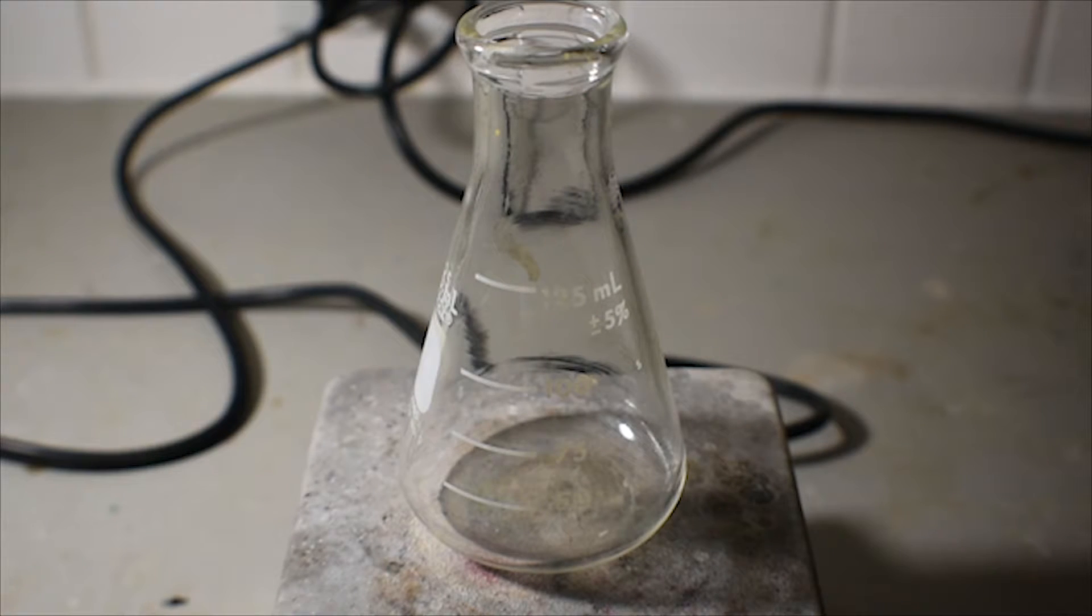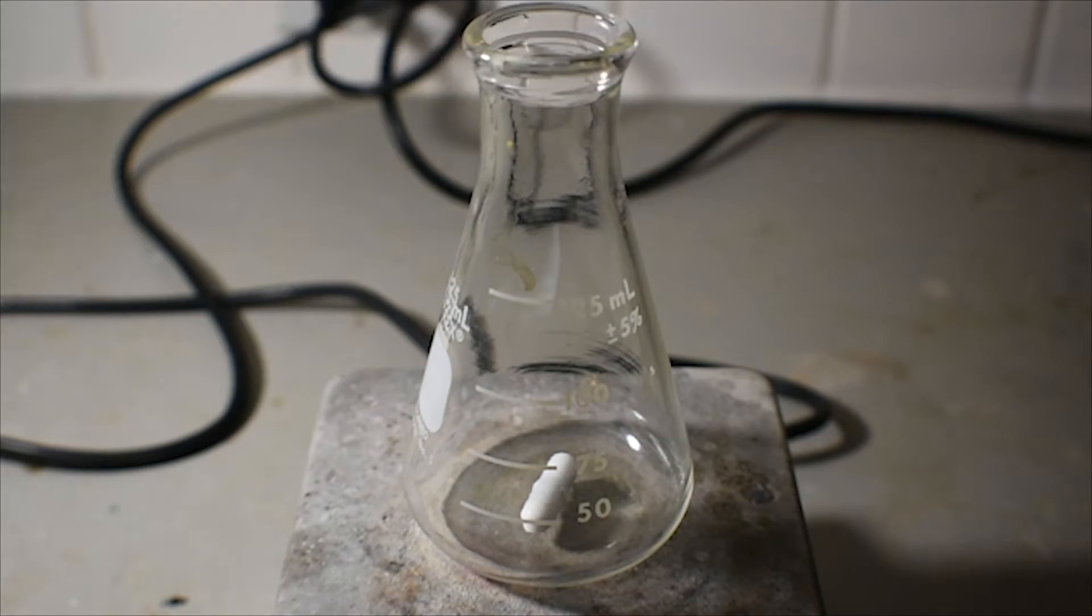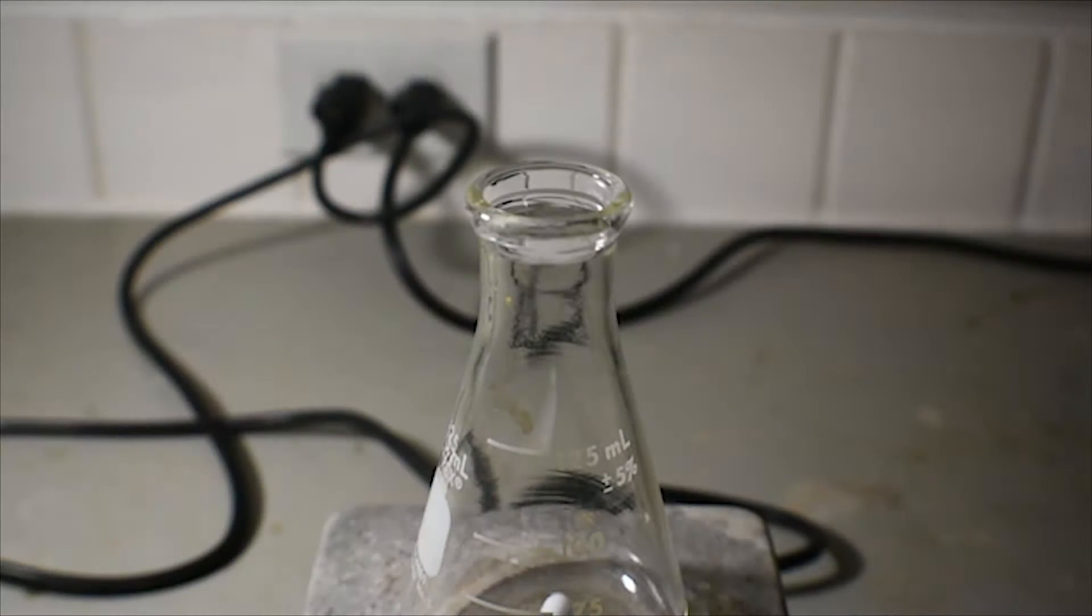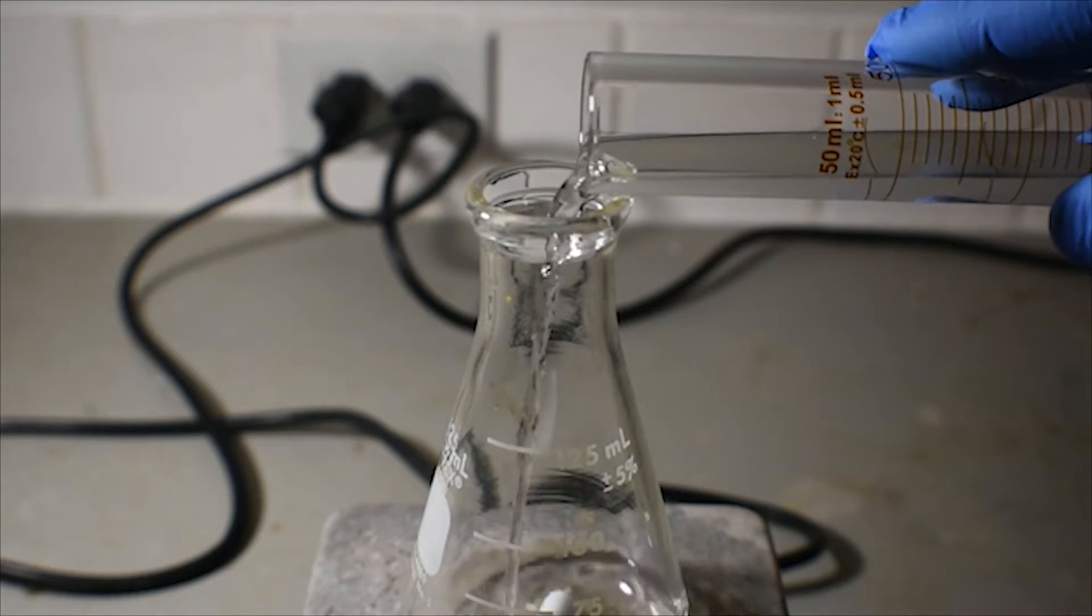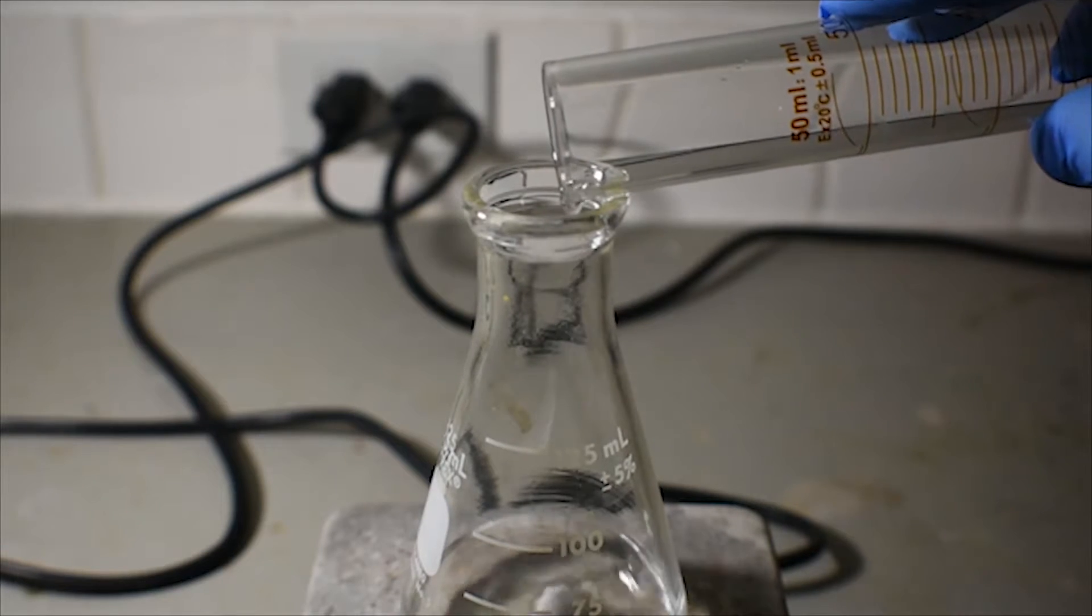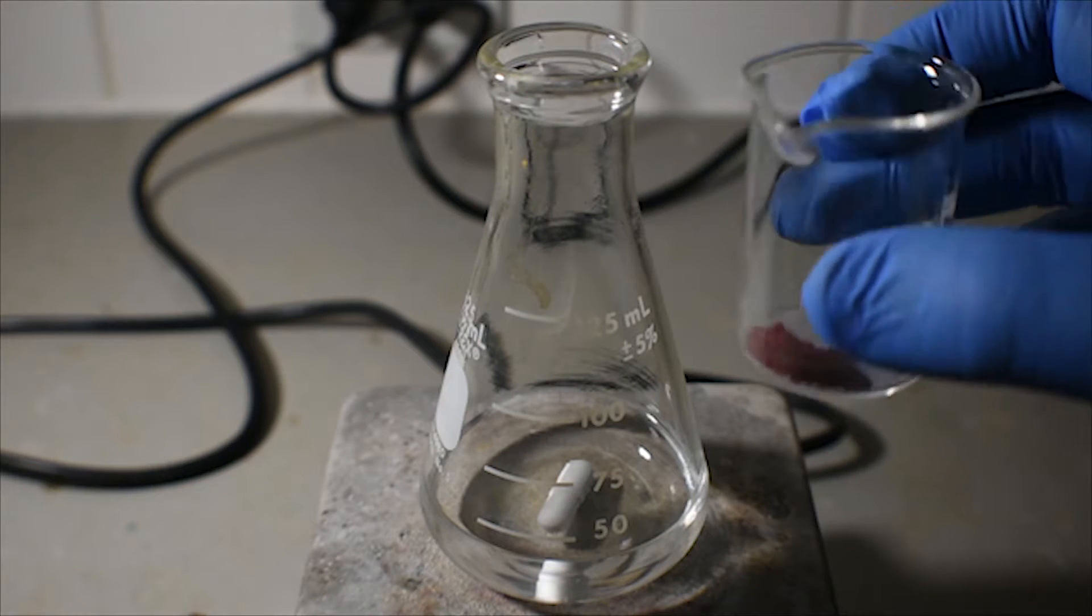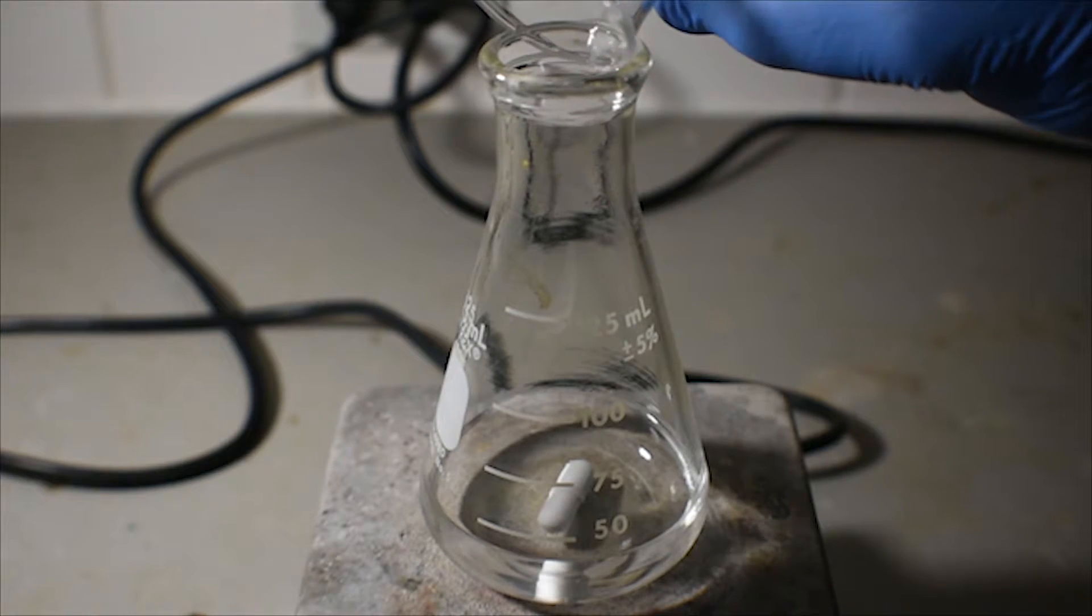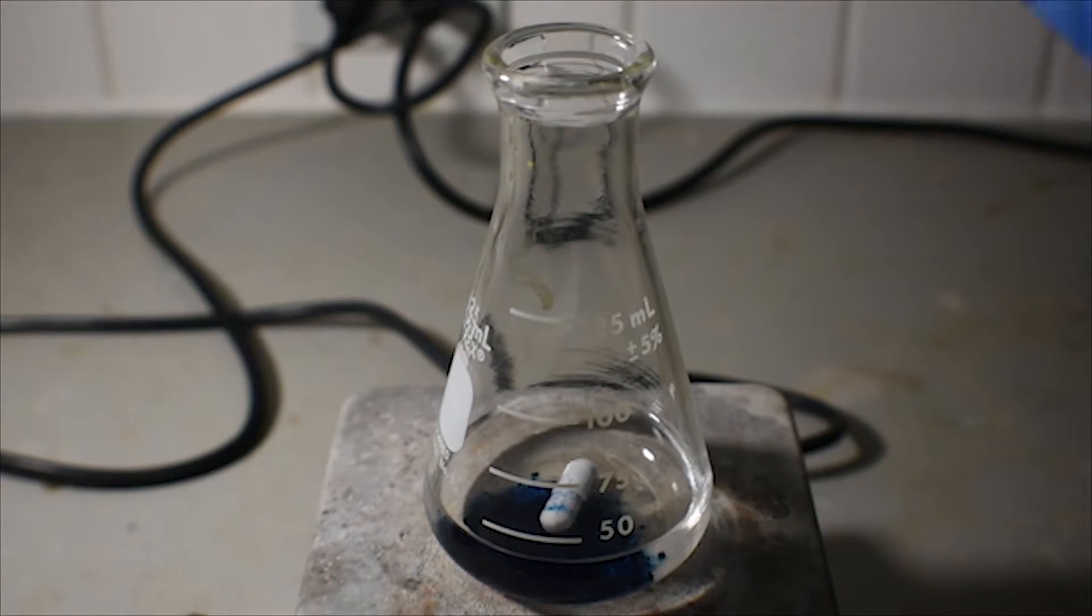Here, on the hot plate stirrer, I have a 125 milliliter Erlenmeyer flask. To this, I'm going to add a medium-sized stir bar. Now I'm going to add the 30 milliliters of 95% ethanol. It doesn't particularly matter in what order you add the reagents, so I'm going to add the cobalt-2 chloride hexahydrate first. We can see the beautiful blue color of the cobalt-2 chloride dissolving in the ethanol.